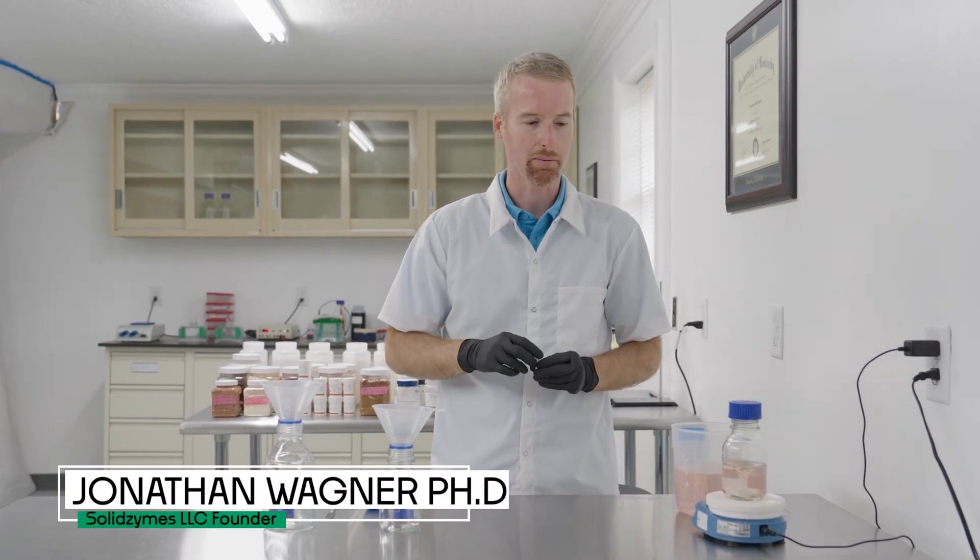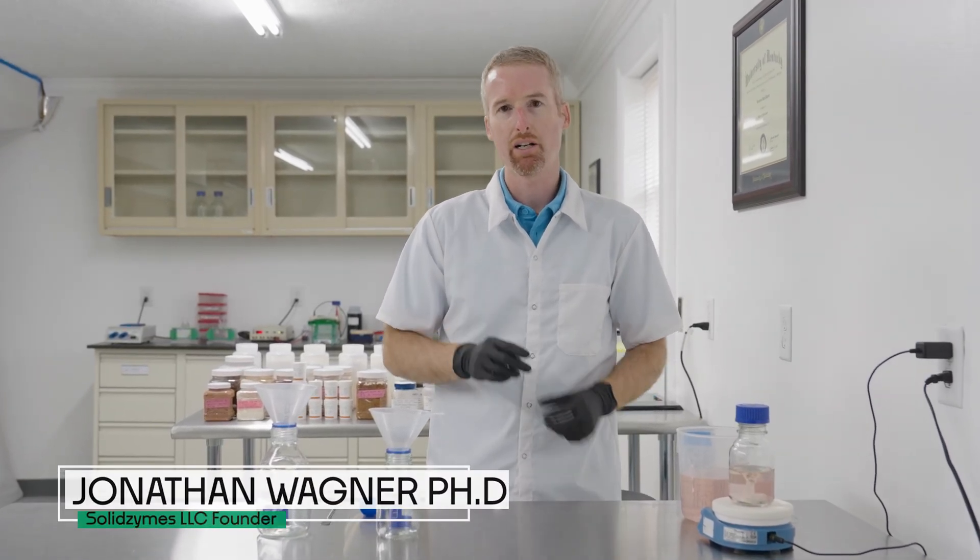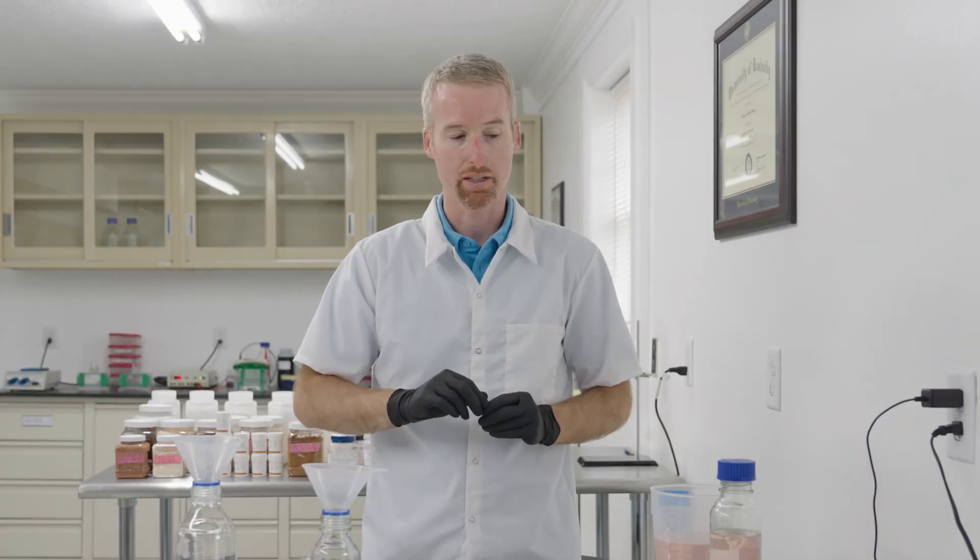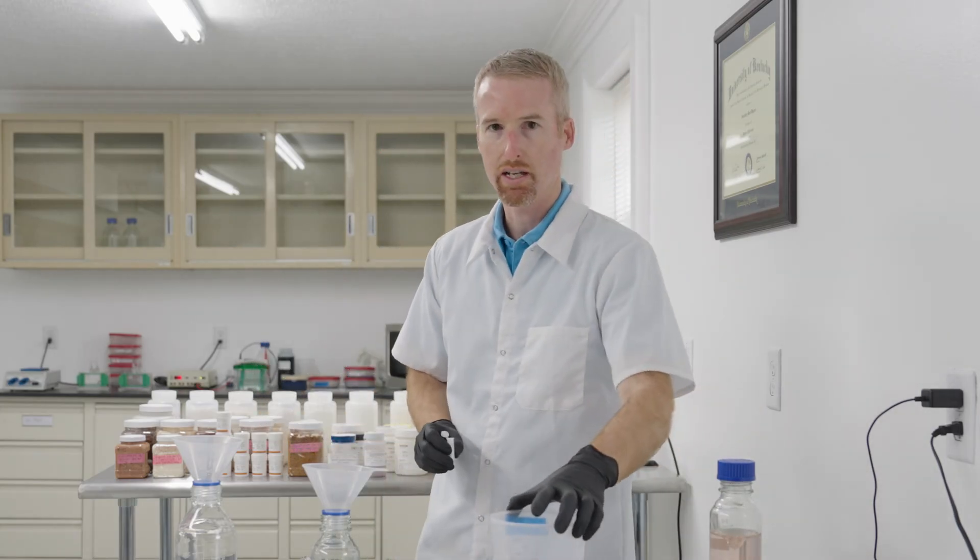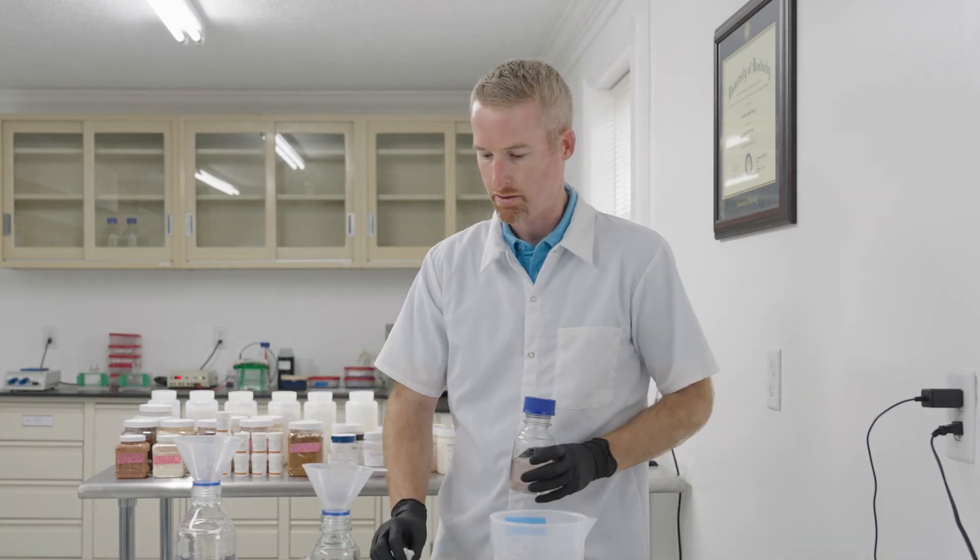Jonathan Wagner here from SolidZymes.com. If you're in the biomanufacturing business, you know that enzymes can be very costly. I want to take a few moments to show you the advantages of immobilizing your enzymes.